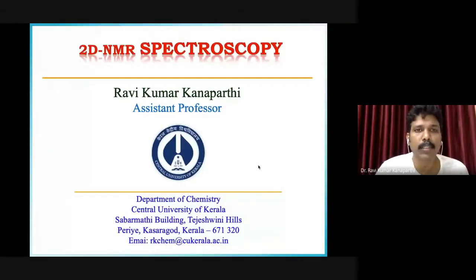And today we are going to discuss 2D NMR spectroscopy. I'm going to give you a flavor of 2D NMR spectroscopy. Fine details will take a lot of time and require a few more classes. As we don't have that much time, I confine myself to one lecture to give you a general idea, or broad idea, about 2D NMR spectroscopy.